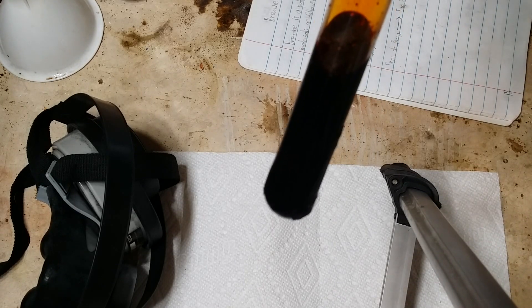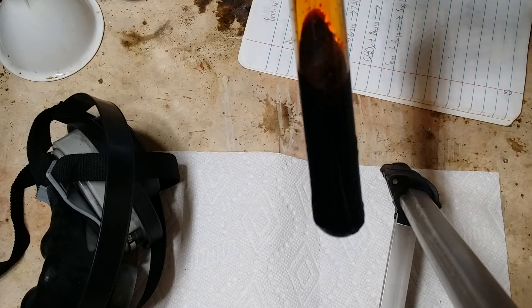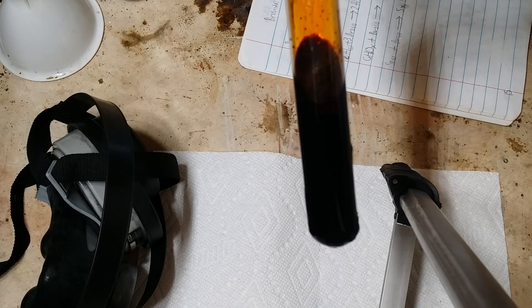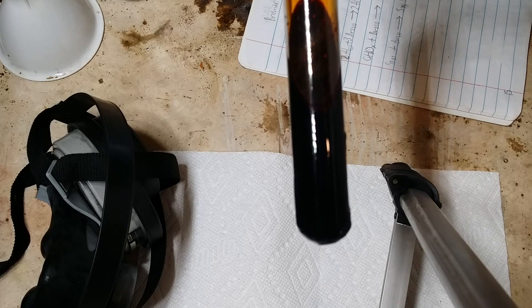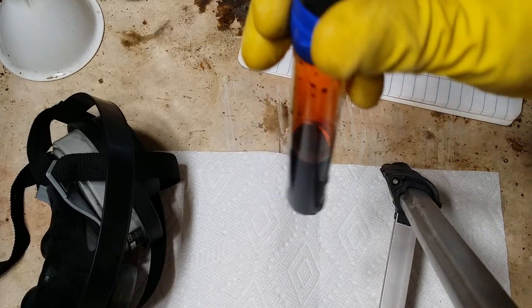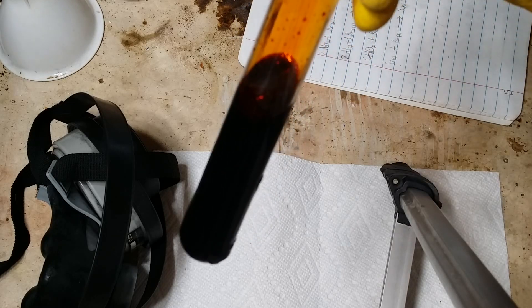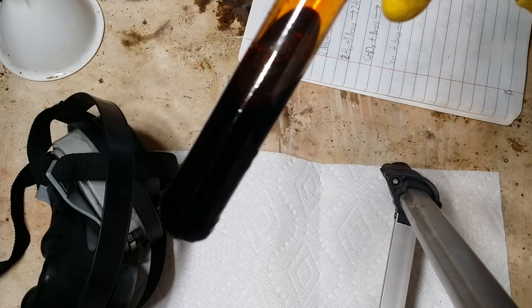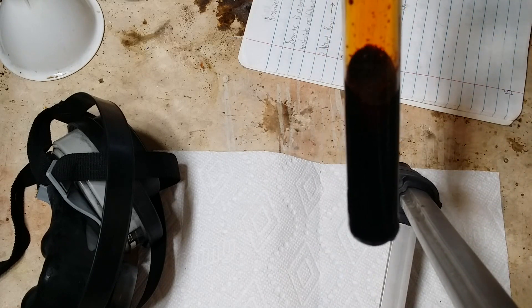Now, before I even think about opening this test tube, I'm going to want to put my respirator on. The vapors from bromine are extremely toxic, and unless you like a lungful of hydrobromic acid, I highly recommend putting a respirator on. The best way I can describe the odor of bromine is if you mix highly concentrated bleach with skunk spray and pepper spray — the odor of this horribly foul liquid would be the result.